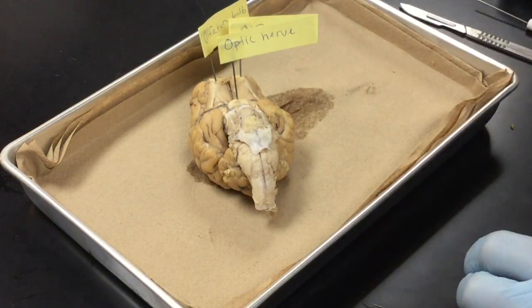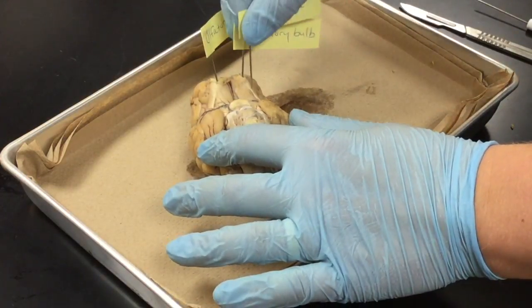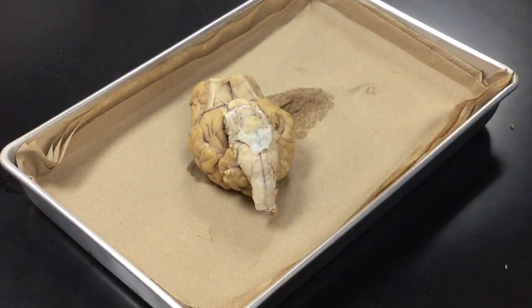Okay, we are now ready to go ahead and start cutting into our brain. The first thing we want to do is to go ahead and remove all of our identification flags that we have used. You can set those to the side. So now you want to go ahead and take your scalpel.